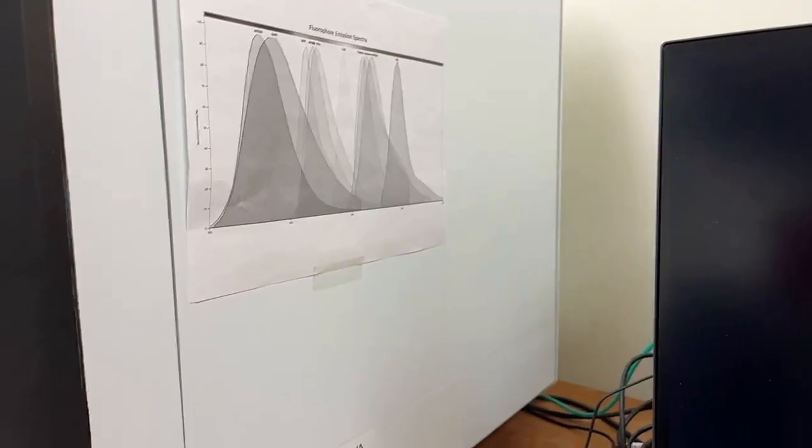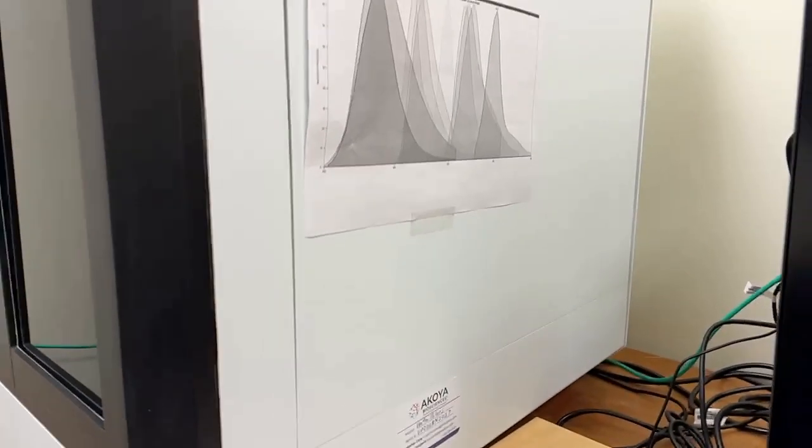I mean, it's a neat microscope because it makes really nice images, but it also just never has anything in focus, and it is absolutely the worst. Because it'll sit there and scan your slides for multiple hours, and then you're like, oh boy, I can't wait to look at the images, and they're all out of focus. And then it has a door, like you can't really see through it. If I ever get it to open, I'll show you.